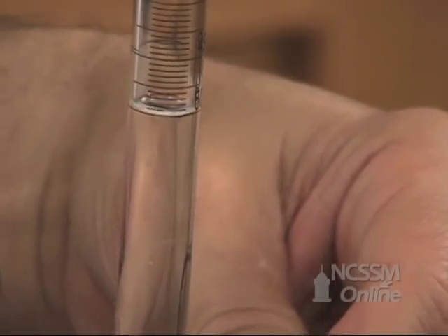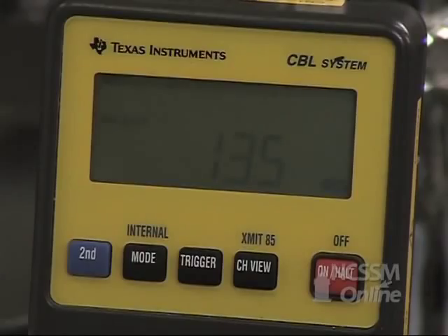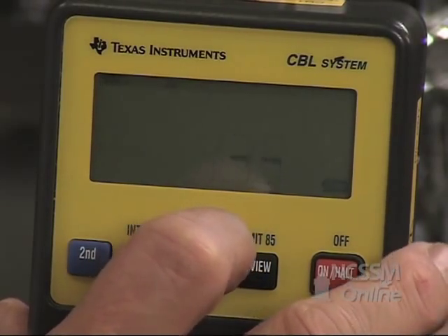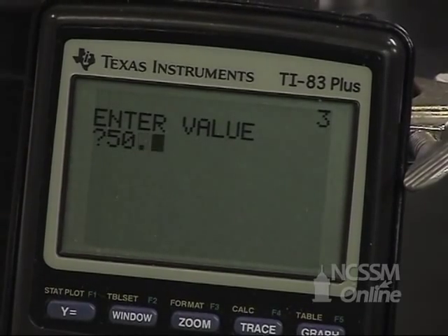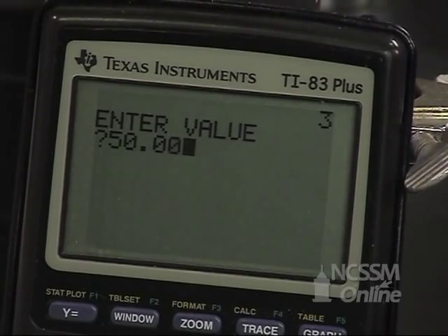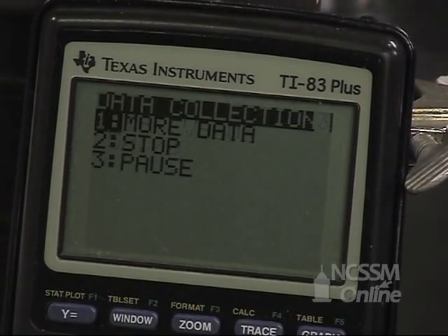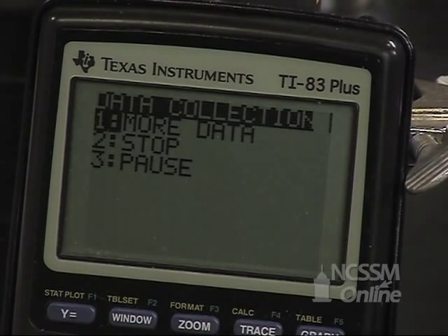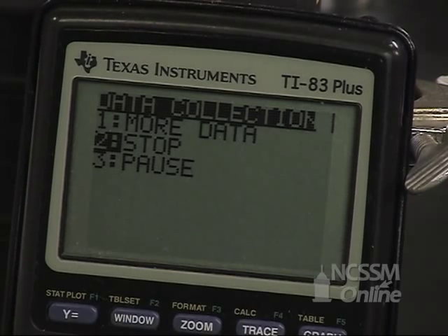When you reach 50 milliliters and the CBL reading is stable, press trigger on the CBL and enter the value in your calculator: 50.00 milliliters. We're ready to stop collecting data, so arrow down to stop and press enter.